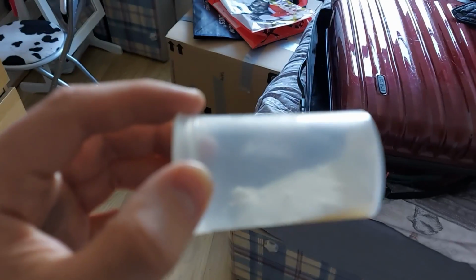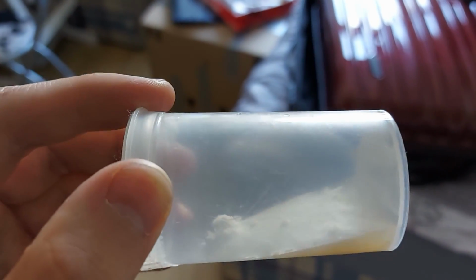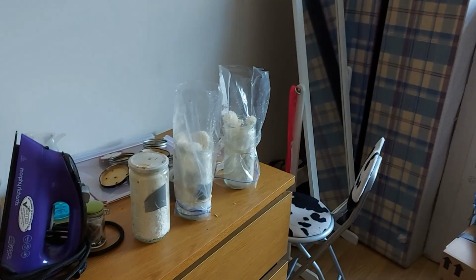And here I have some lion's mane, which I've previously cloned. And it looks mental on agar, it just fruits on everything. You can see here I've got some on the side, which I'm currently fruiting. And I'll make an instructional video on how you can do that in the future.